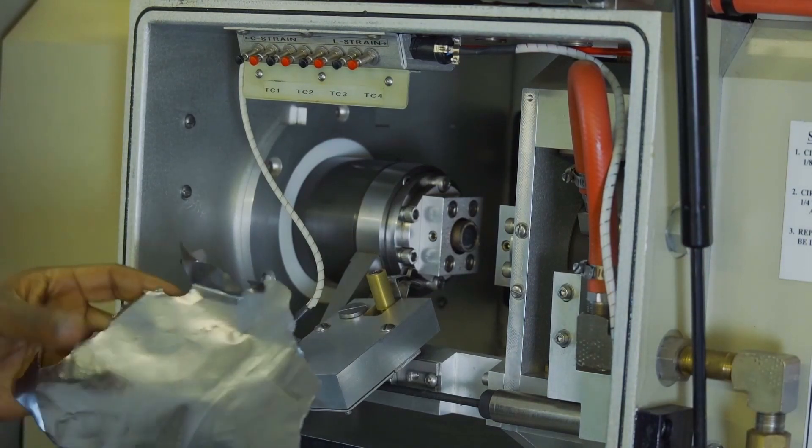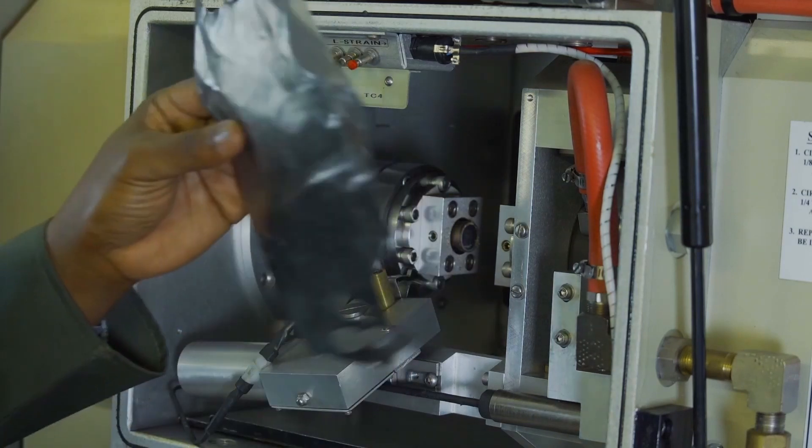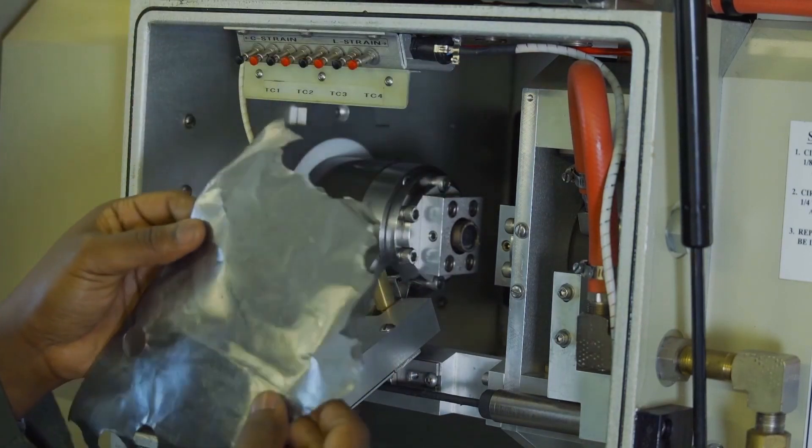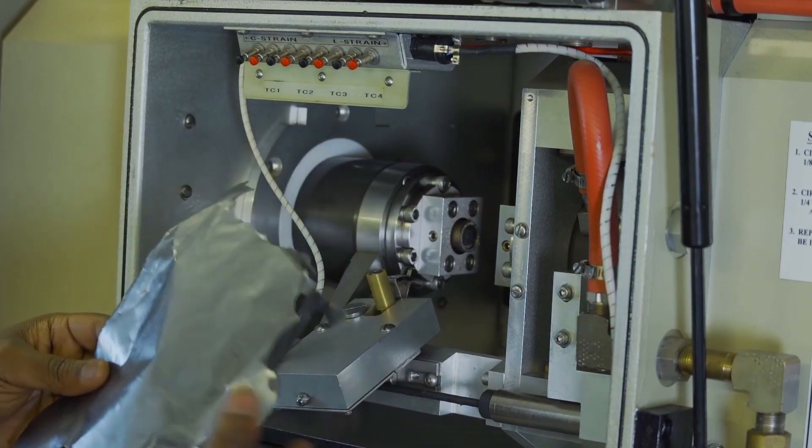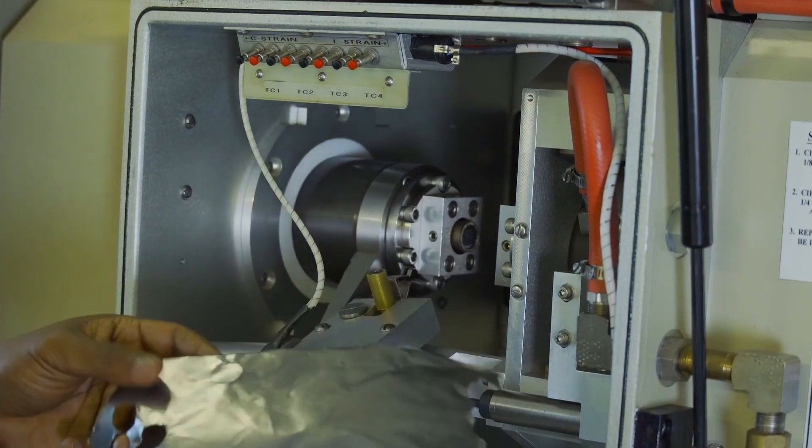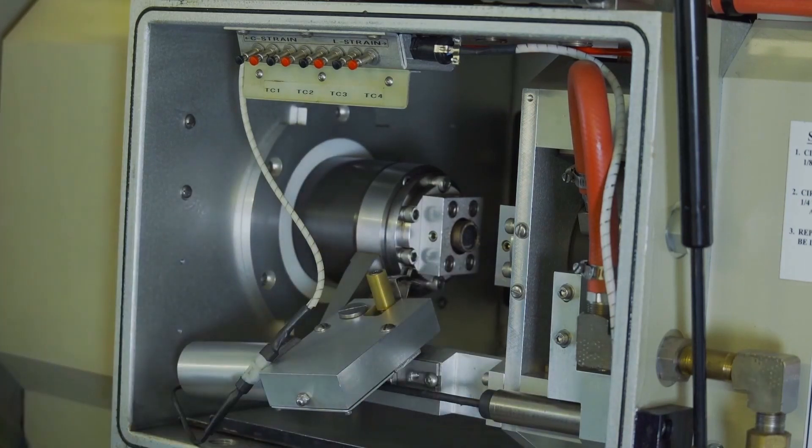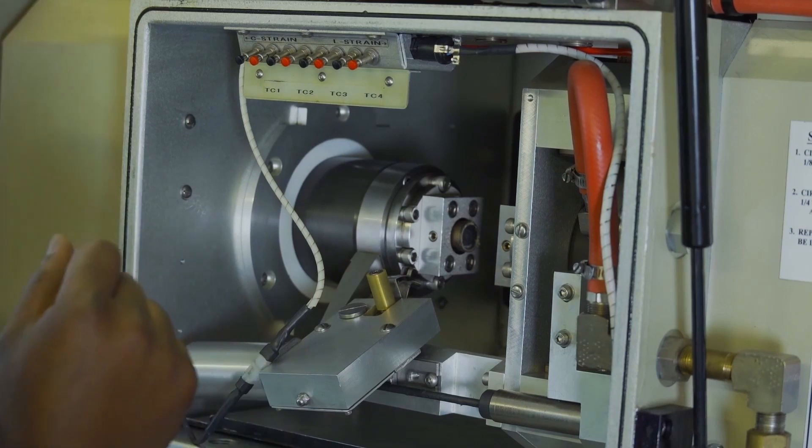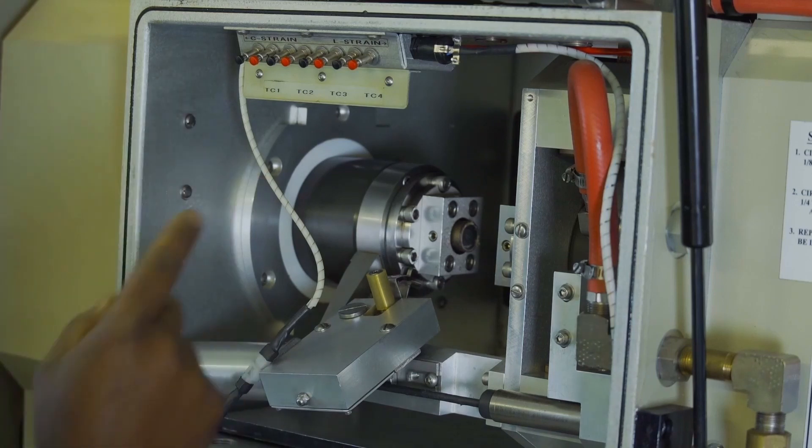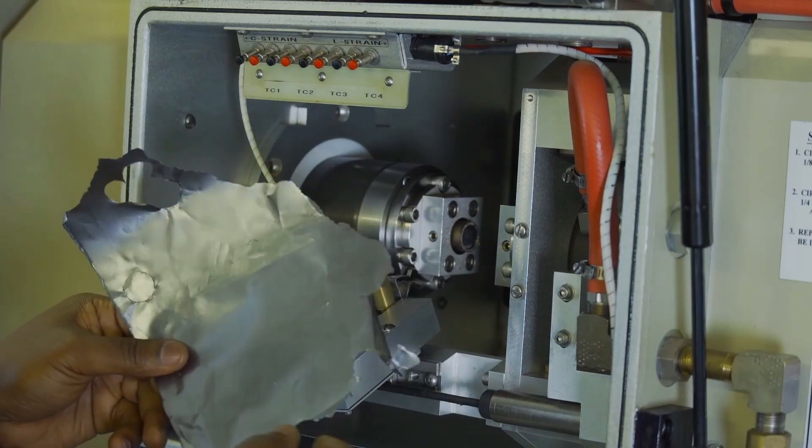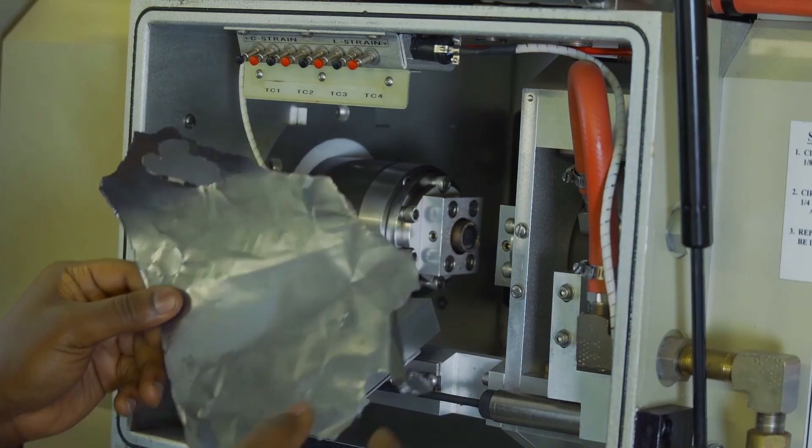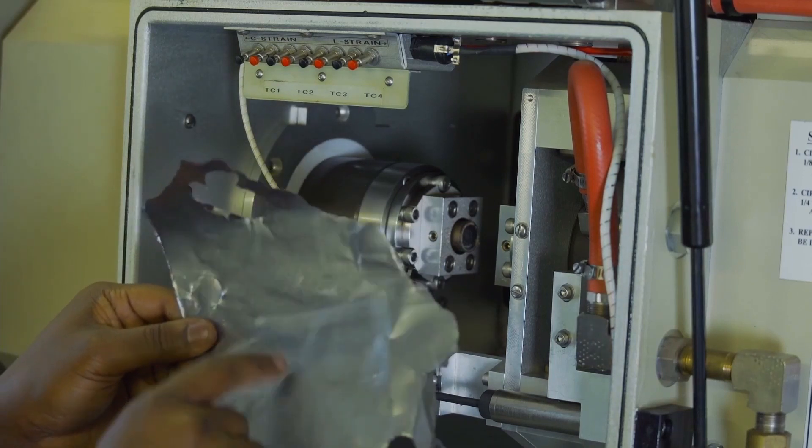If you're testing steel or titanium, you use graphite foil that I'm showing you here, or you can use tantalum foil, but tantalum foil is quite expensive. For aluminum, we found out that just using nickel paste is sufficient. When doing titanium and steel or other types of metals except aluminum, it's better to use either tantalum foil or graphite foil.